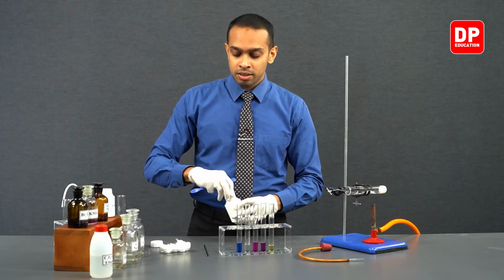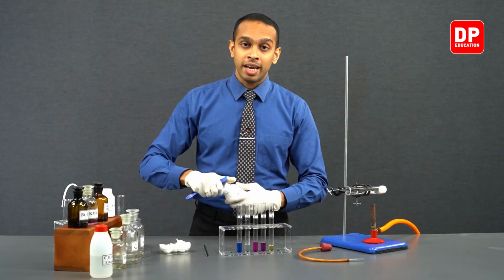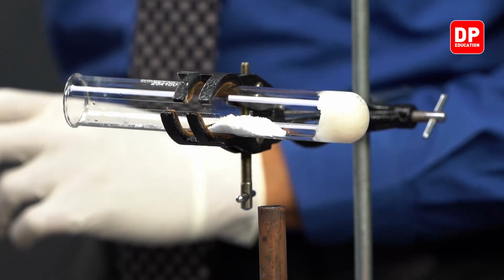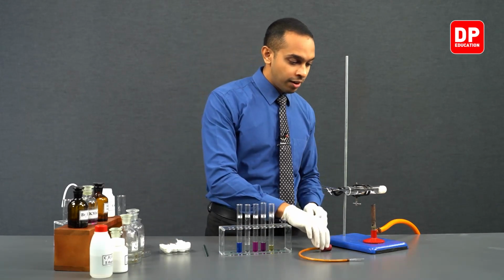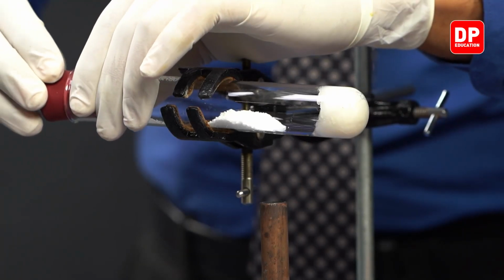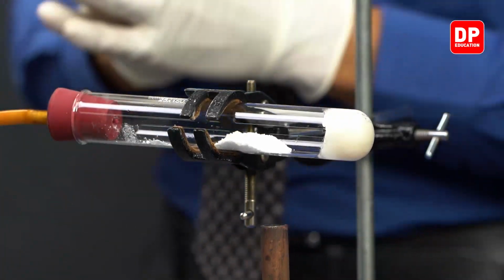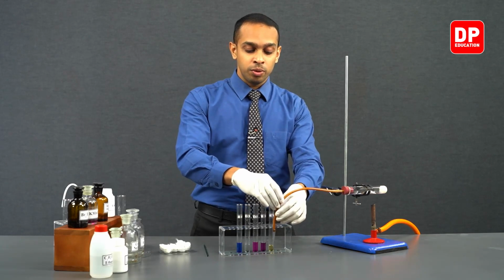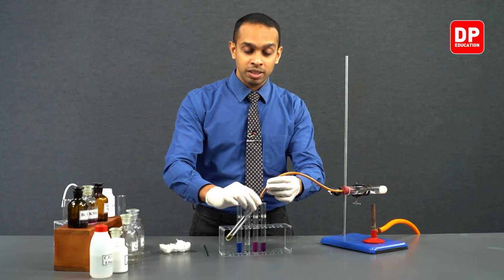Now students, after adding the alumina, we can move on to close up the boiling tube with the help of a rubber stopper. We have our rubber stopper here. We can close it up with the help of this rubber stopper, and this rubber stopper is connected to a delivery tube. So this delivery tube will help us deliver the gas that is produced into each of these test tubes.